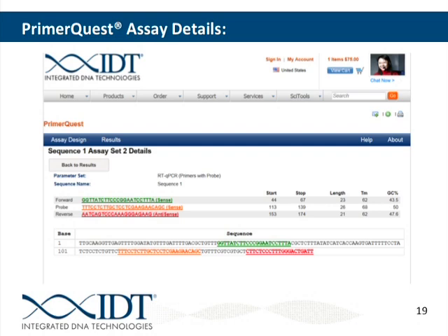And hopefully they'll be specific to our RCI2A. Scroll through these and see an overall summary of the hits.